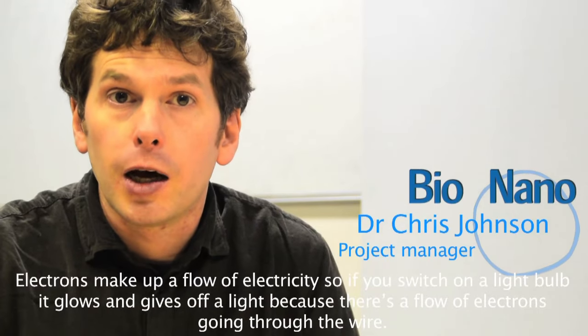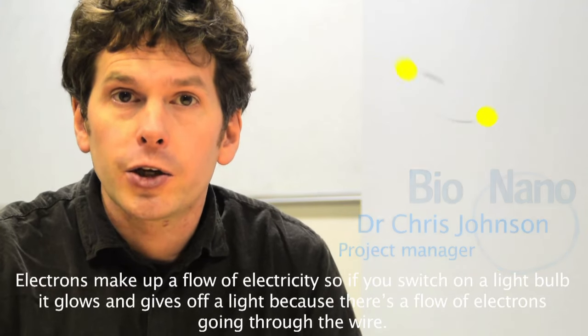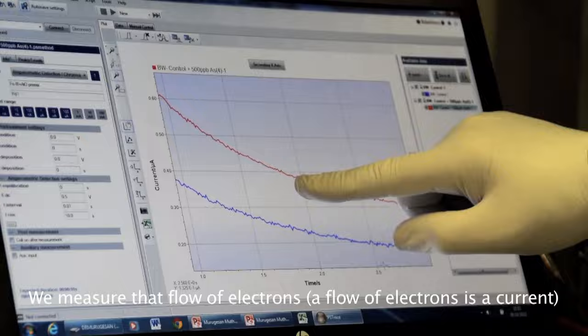Electrons make up a flow of electricity. So if you switch on a light bulb, it glows and gives up light because there's a flow of electrons. And we measure that flow of electrons — the flow of electrons is a current.